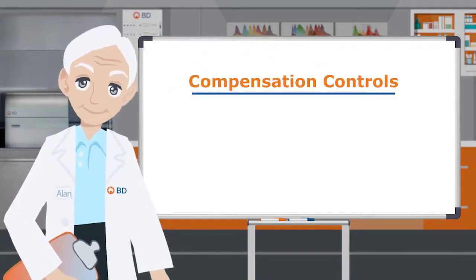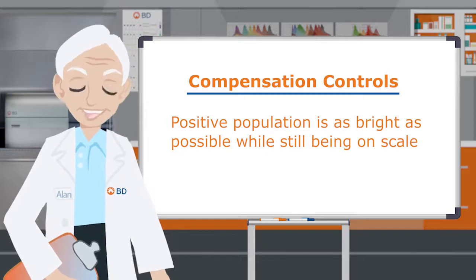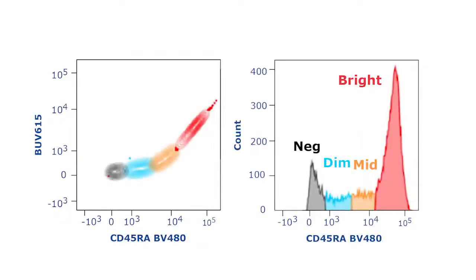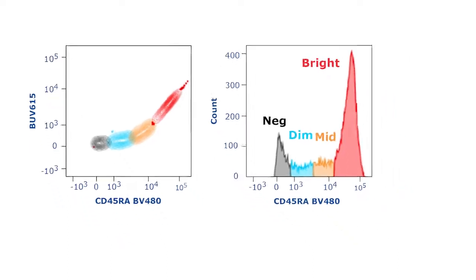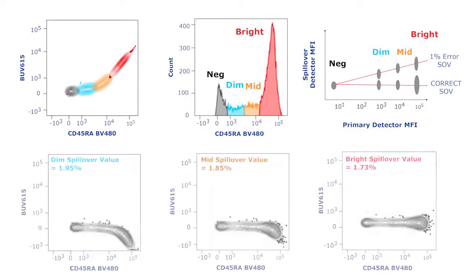The last principle requires that the positive population is as bright as possible while still being on scale. If you are using cells stained with a reagent with a broad range of fluorescence, as shown here with CD45RA, gate on the bright population, as shown in red, as your positive population. Errors in the spillover calculated from using dimmer cells are magnified at higher MFI. Correct compensation is best achieved when spillover values are calculated from the brightest population.